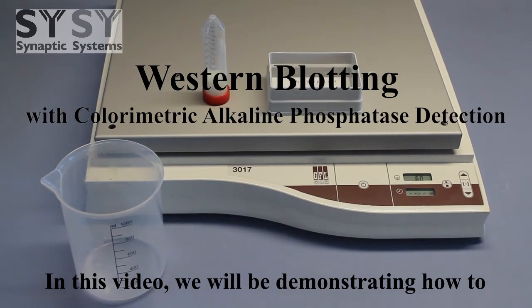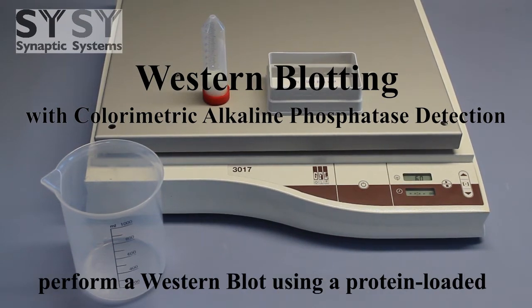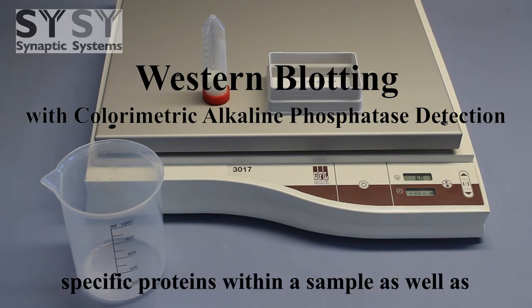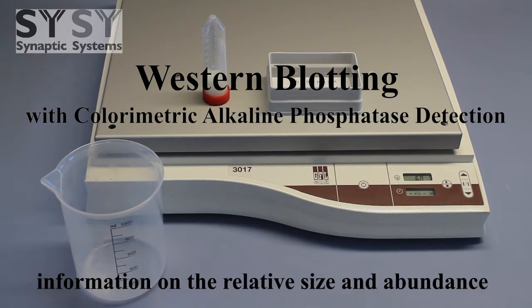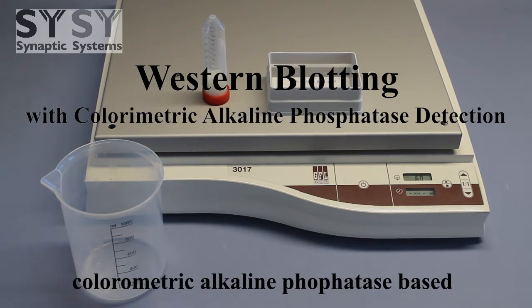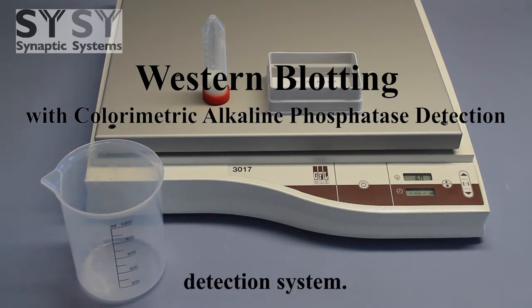In this video, we will be demonstrating how to perform a Western blot using a protein-loaded membrane. Western blots can be used to detect specific proteins within a sample, as well as information on the relative size and abundance of the protein. We will use the colorimetric alkaline phosphatase-based detection system.